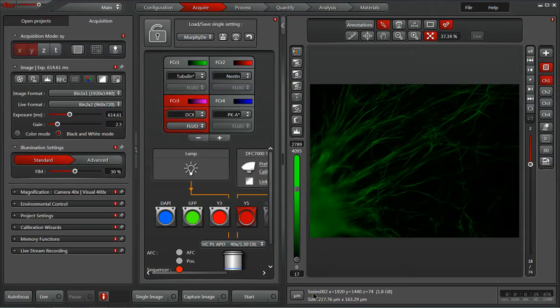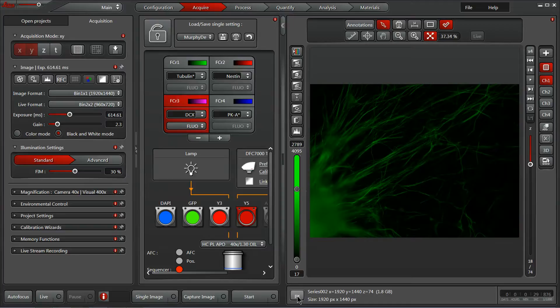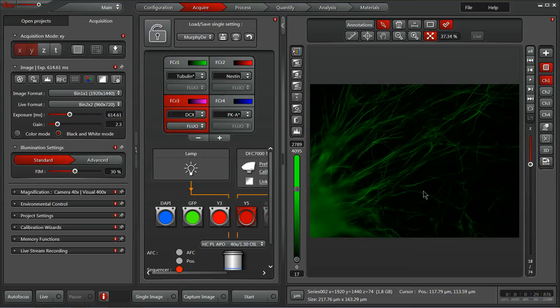On the right side as well we have an image displayed in microns here. We can change that to pixels if we prefer. And if you hover over any position the cursor position will show up giving you that XY location in either microns or pixels if you prefer.